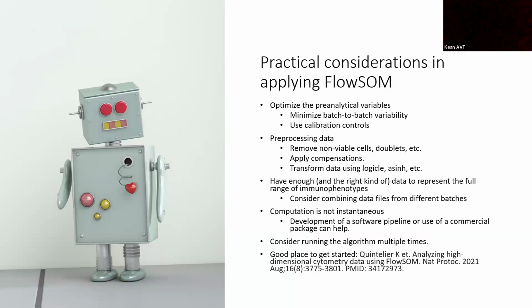Some of those transforms will also involve choosing which markers are most important for the mapping you want to make. And you can also add additional weights to those markers. So say I want this marker to have twice the weight of another marker. You can do that before the step where you feed the data to the FlowSOM algorithm.